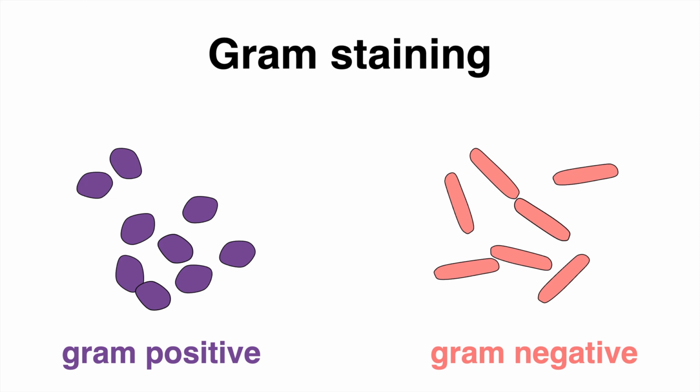It is important to determine the physical properties when targeting pathogens with antibiotics. In general, it is much more difficult to treat gram-negatives because of their additional outer membrane. Antibiotic resistance is a serious threat to human civilization. Labs around the whole world are constantly developing new and effective antibiotics.